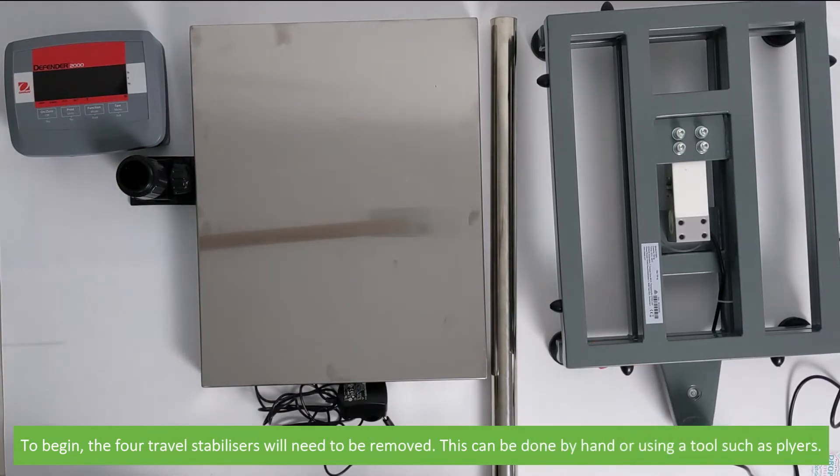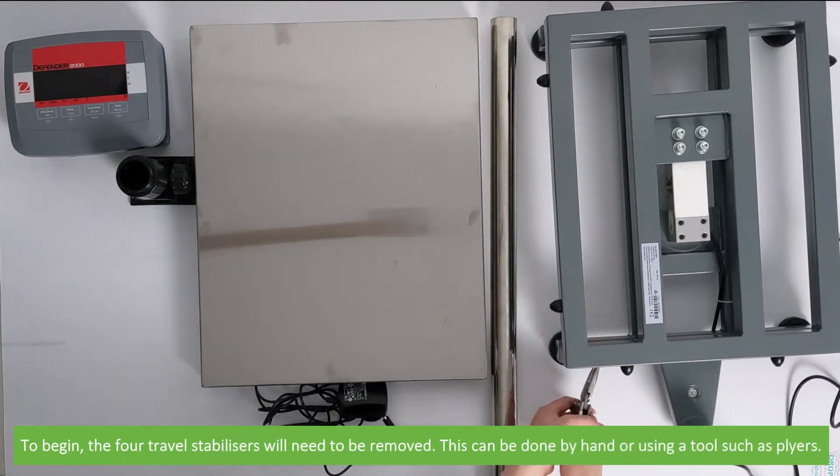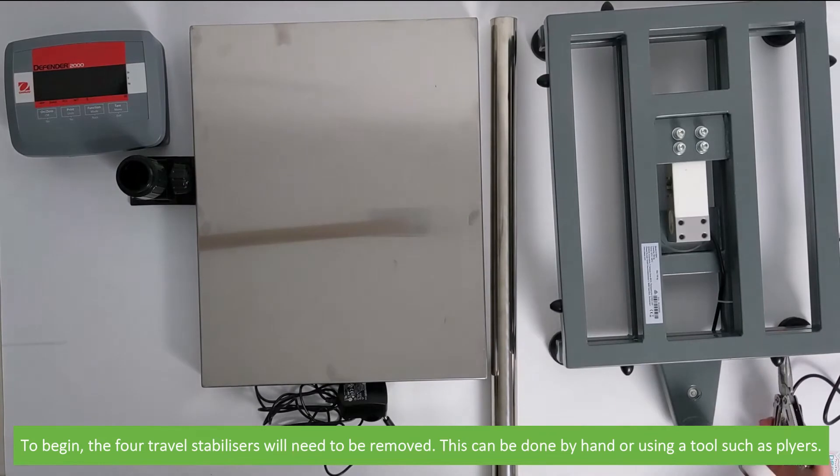To begin, the four travel stabilizers will need to be removed. This can be done by hand or by using a tool such as pliers.